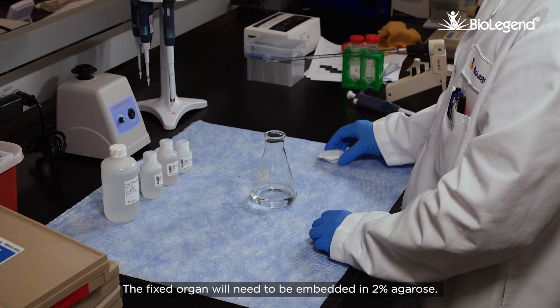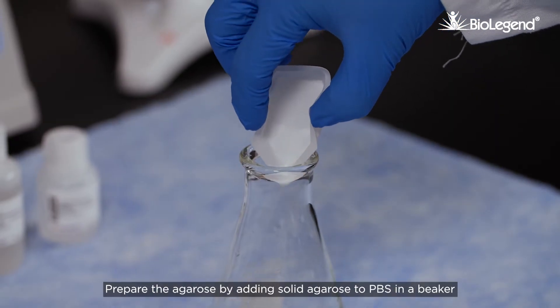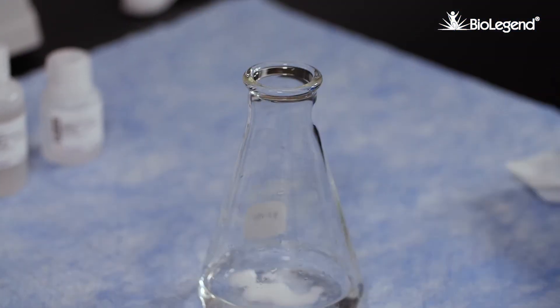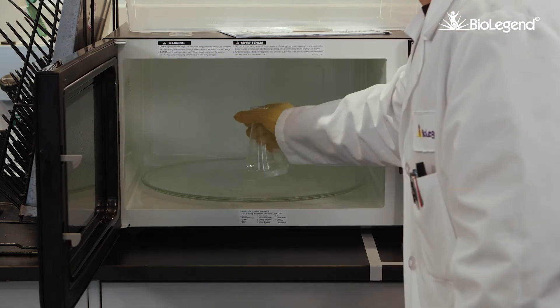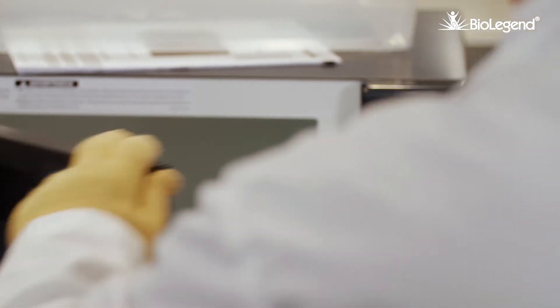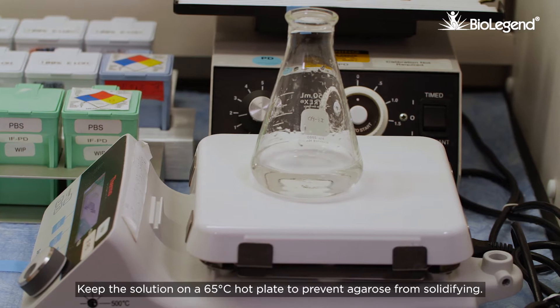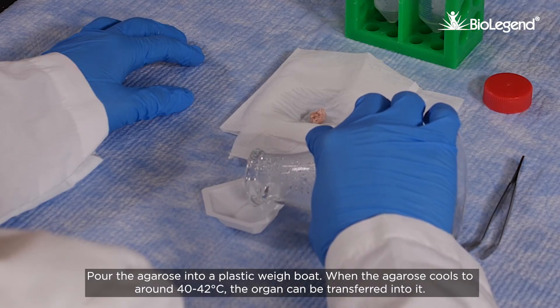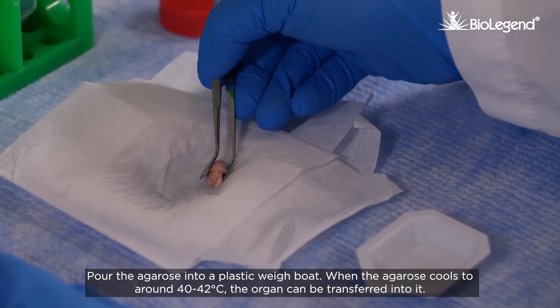The fixed organ will need to be embedded in 2% agarose. Prepare the agarose by adding solid agarose to PBS in a beaker and melting in the microwave. Heat and stir until the agarose is completely dissolved. Keep the solution on a 65 degrees Celsius hot plate to prevent agarose from solidifying. Pour the agarose into a plastic weigh boat. When the agarose cools to around 40 to 42 degrees Celsius, the organ can be transferred into it.